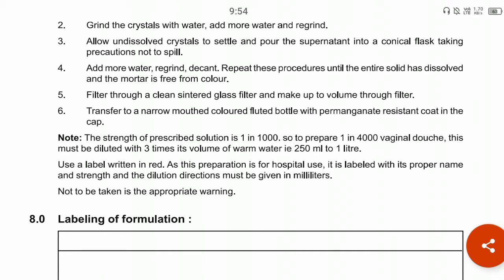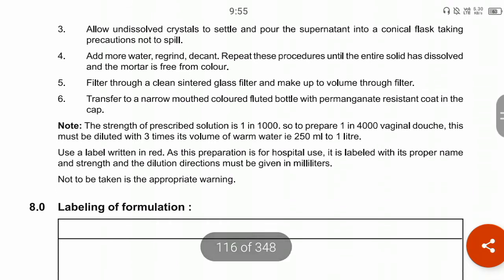Note that the strength of the prescribed solution is 1 in 1000. To prepare a 1 in 4000 solution for use, it must be diluted with three times its volume of water — that is, 250 ml to 1 liter. The label should be made in red as this preparation is for hospital use, labeled with its proper name, strength, and dilution directions in milliliters. An appropriate warning 'not to be taken internally' must also be included.